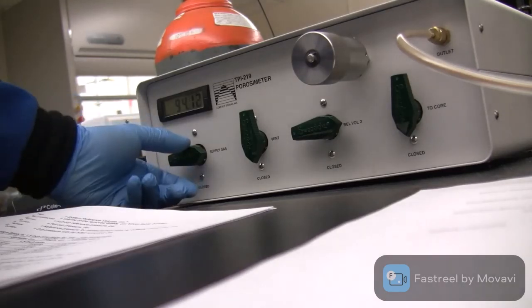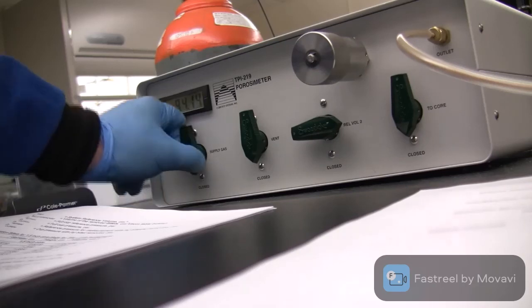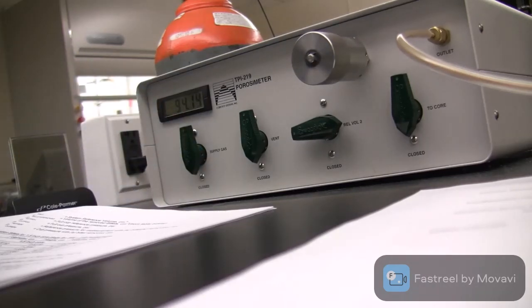If it's stable, not yet. Okay, should be good enough. Close the supply gas valve. Now we isolated the nitrogen cylinder. So wait again for 10 more seconds.